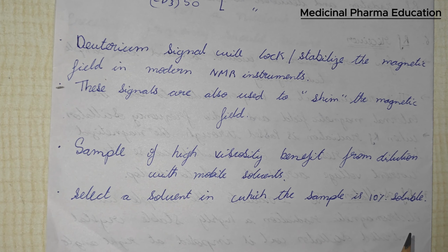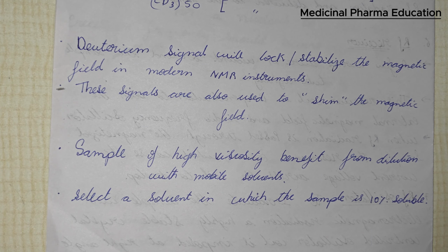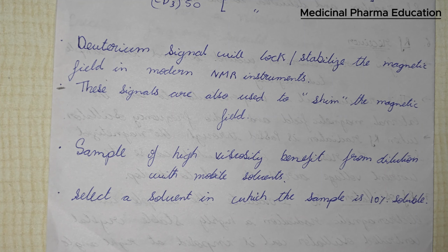Next we are going to discuss the relaxation process, which is very important. Let's continue with the relaxation process.